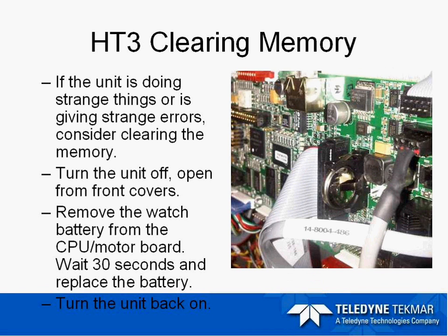Clearing the memory on the HT3 is pretty easy. Open the front door of the HT3 — the large board in the center is the CPU motor board, and this is where the battery is stored. If the instrument is doing something strange or giving strange errors, turn off the unit, open the panel, and locate the coin-size battery on the CPU board. Remove the battery or put something between the battery and the clip to break the connection, and then turn the unit back on. The method parameters will be wiped out, but since the instrument is PC-controlled, all you need to do is re-download your method from the software. The battery is a 3-volt CR2032, a very common size sold at many drug stores, and it holds all your methods and configurations.